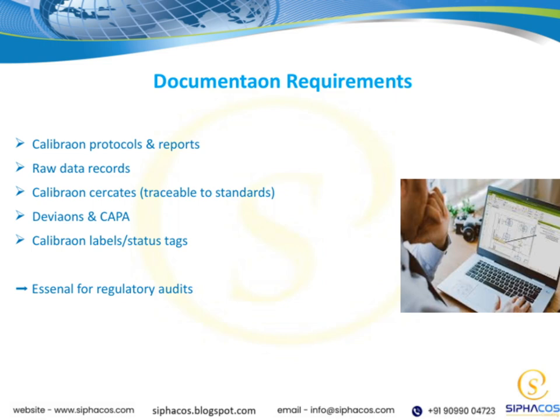All of these documentation elements are not just best practices, they are essential for regulatory audits. Proper documentation demonstrates compliance, ensures traceability, and ultimately supports the integrity of your calibration program. Remember, thorough documentation is key to maintaining trust and meeting regulatory standards.